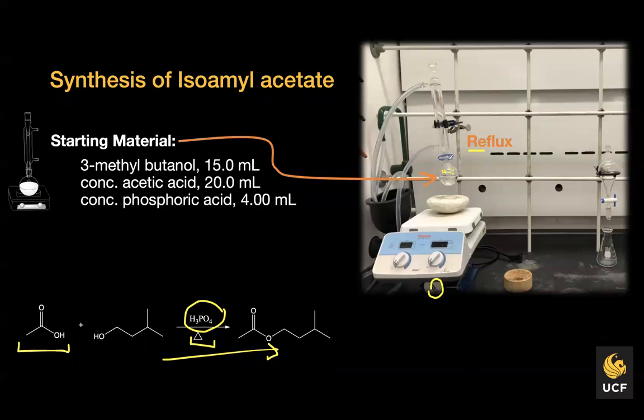They'll condense right within the round bottom flask, and then you'll notice that they'll start condensing within the neck, and then they'll go right within the water condenser, and somewhere within the water condenser, however high up those vapors reach, they'll eventually form what we call a reflux ring or a condensation ring.